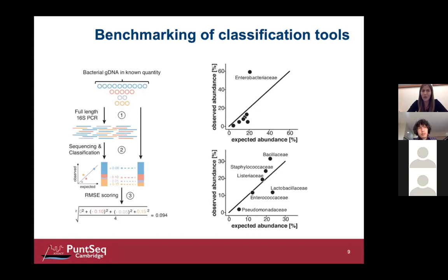And we thought a lot about how we could deal with this problem to compare our classification tools. But the best solution that we ended up with was to just exclude Enterobacteriaceae from this analysis for now. And this is the plot that you see below, to see how the relative composition of the remaining bacteria that have not been over-amplified by the primers performs.